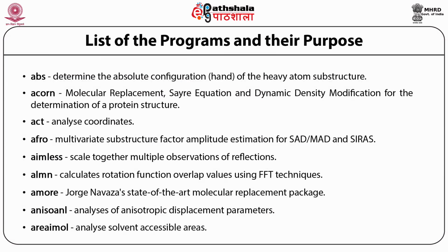So this lists the programs contained in CCP4 along with the purpose. As time is short, I won't be able to explain all the programs, and some of the important programs I will try to explain to you.